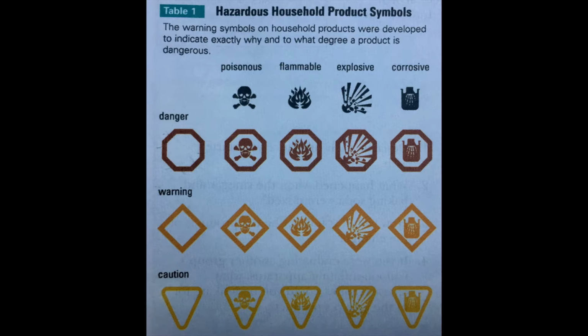So those are the major symbols that you should be able to know when identifying dangerous materials in a laboratory.